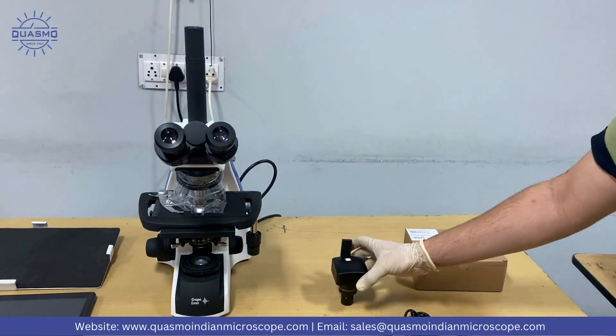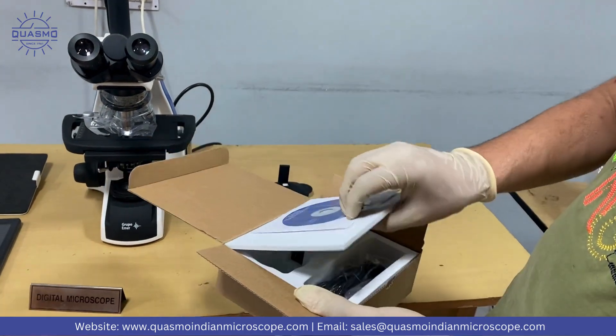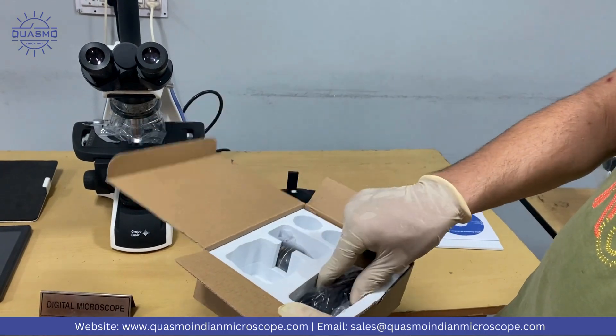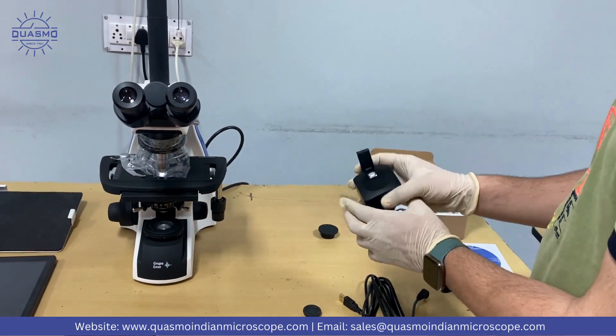One thing I want to tell you: in the camera box, we'll provide one CD through which you can install the software on any other computer. The box also includes the C-mount camera and one computer connecting cable.